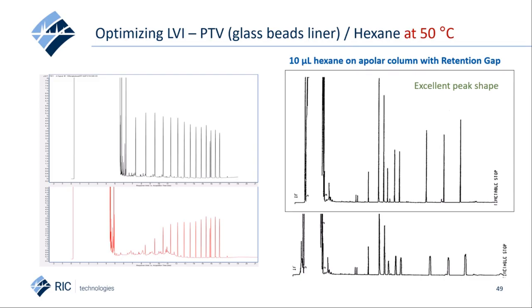However, even with a glass beads filled liner for better solvent contact and more performant venting, it was difficult to obtain a similar chromatogram as with the early vapor exit setup. In order to avoid discrimination of the most volatile hydrocarbons, still too much solvent was brought onto the analytical column, resulting in distorted peaks and general bad chromatography. This is shown by the chromatogram in red.